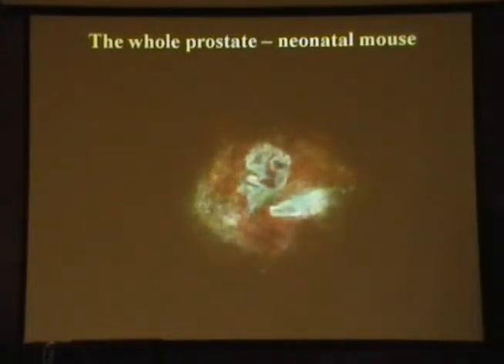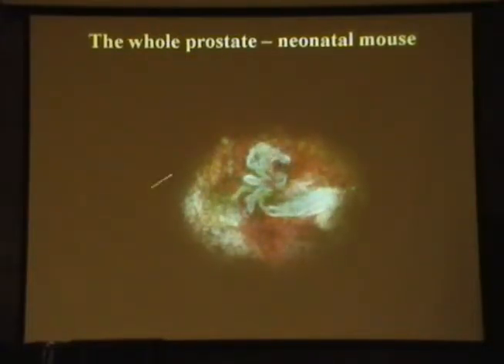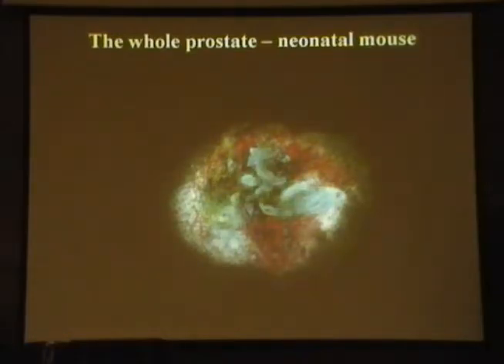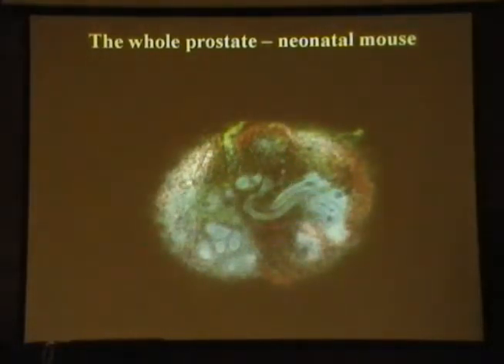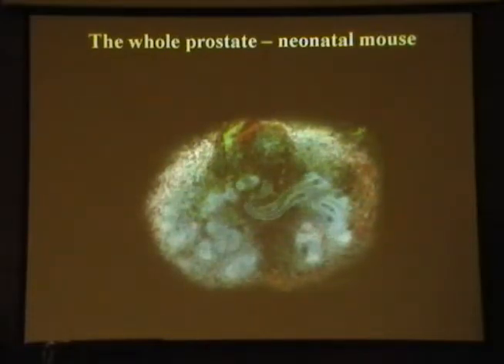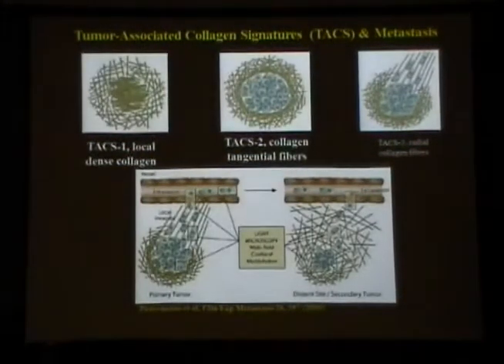The other day he took the whole prostate of this newborn mouse here, and we are looking at two second harmonic and one fluorescence channels of all the depths of the prostate of the specimen. But the best thing we want to understand is related to cancer.